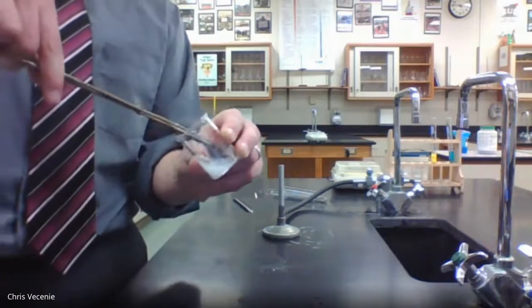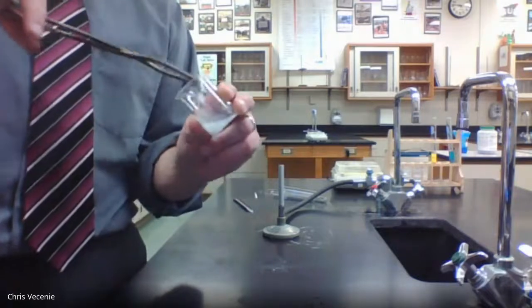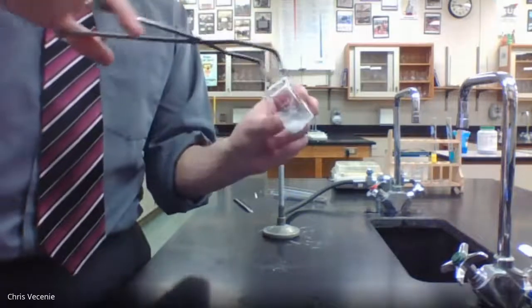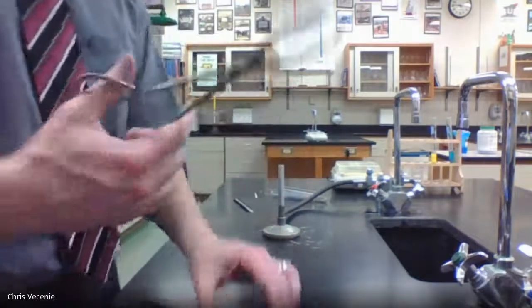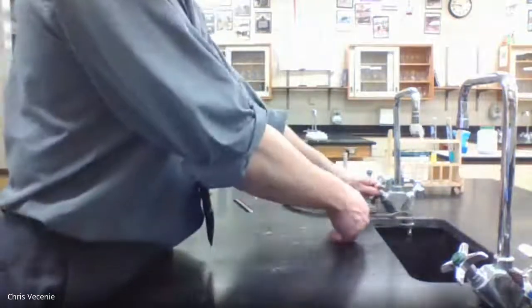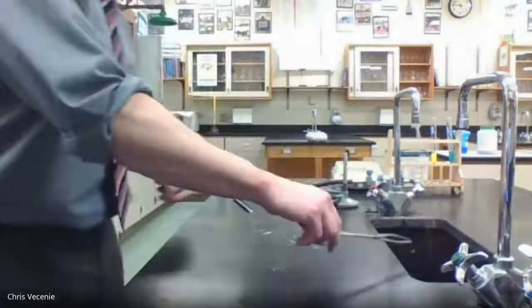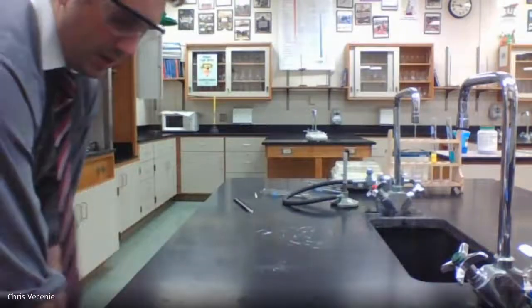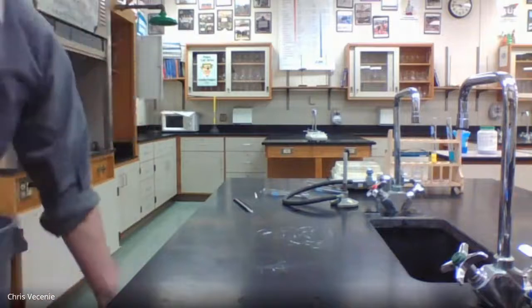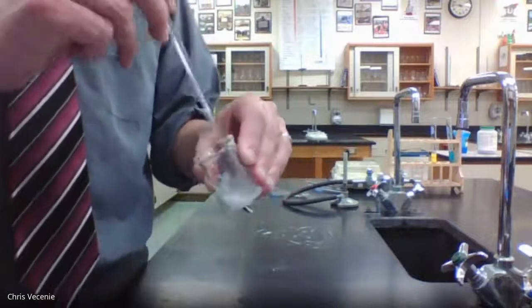Now, what I'm doing is I took those ashes and I got them inside of my little tiny beaker here. And what I'm going to do is get those guys to dissolve. I'm going to try to get the ashes off the edge of my beaker tongs as much as I can, but we have plenty of ashes in there. So off my beaker tongs, they're good to go. Put those back right in my drawer. I'm just going to go get my stir bar, and really try to break this up and get it to dissolve.